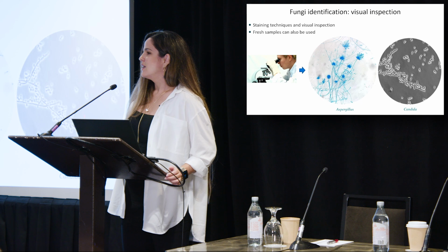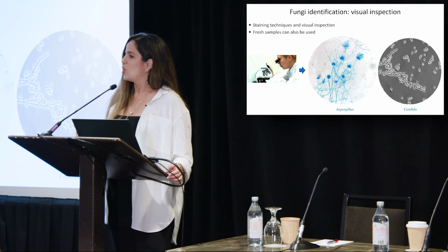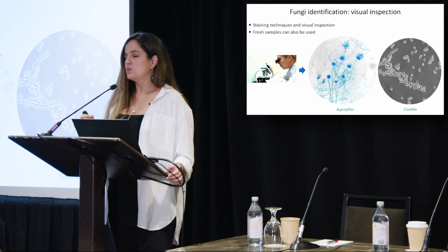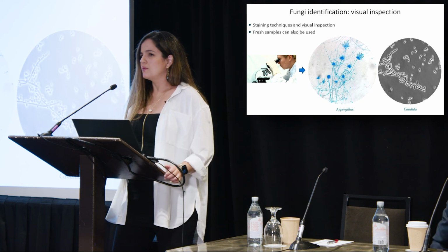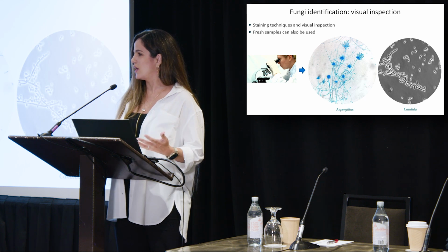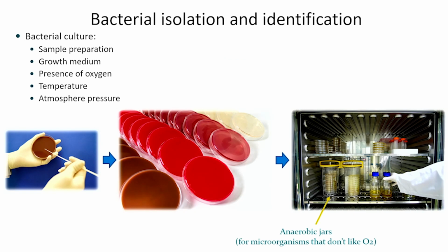Or in this case, Candida albicans. And Candida albicans is a very important microbe, especially in the small bowel. It's one of the most important ones and is associated with patients with small intestinal fungal overgrowth. Right? So after we search and see what the majority of the microbes in a specific site are, we can do what we do best in the lab. We need to culture these microbes for further identification. And culturing these microbes involves a lot of steps, right?